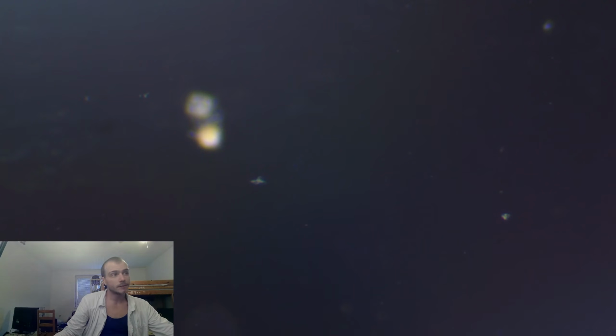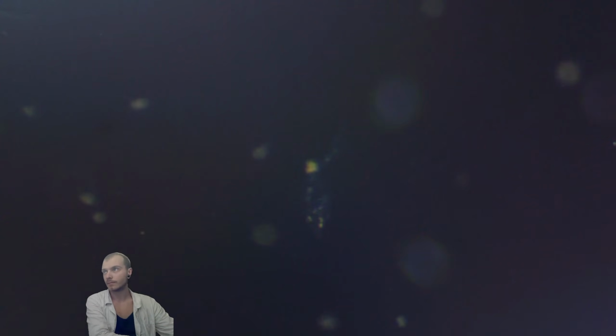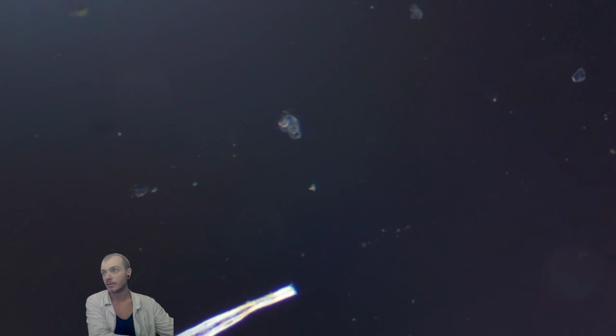Okay. This is a dead part of the Pyrocystis fusiformis. This again dead. I'm afraid I killed them accidentally, as I put the cover glass here. And probably... here it is.